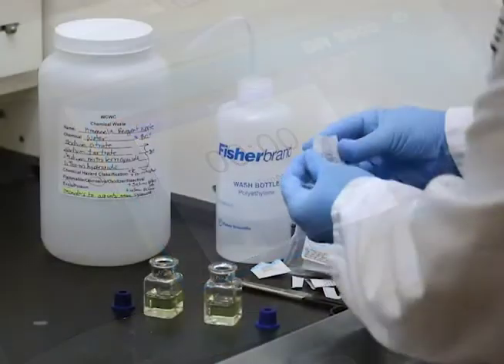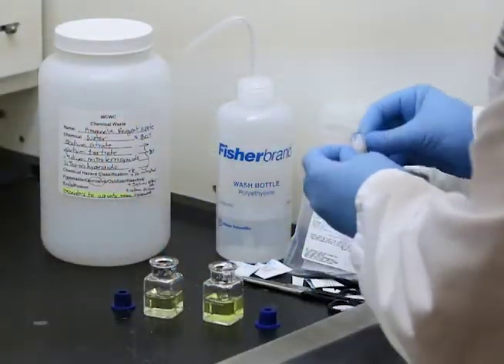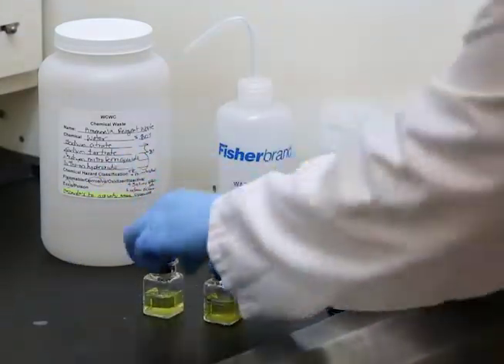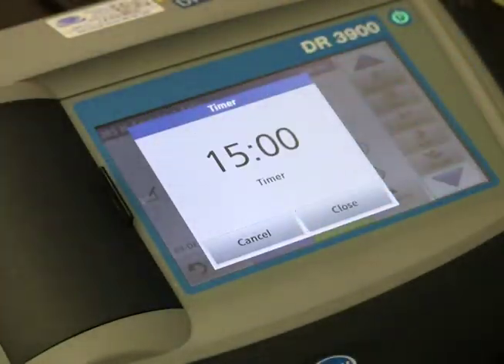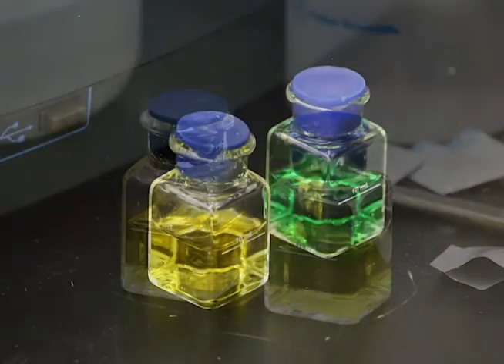When the timer expires, add the contents of one ammonia cyanurate powder pillow to each cell. Stopper the cells and shake to dissolve the reagent. Start a timer for 15 minutes. Ammonia nitrogen is present in the sample if a green color develops.